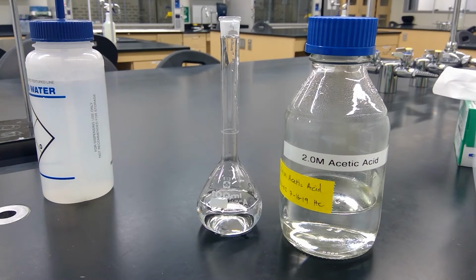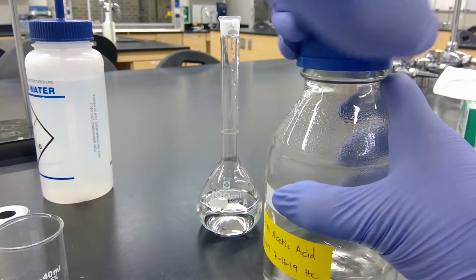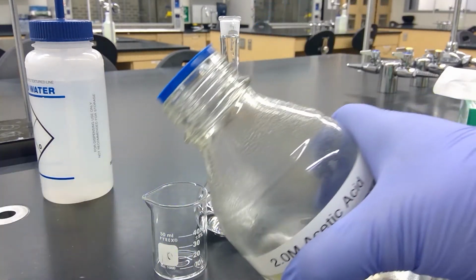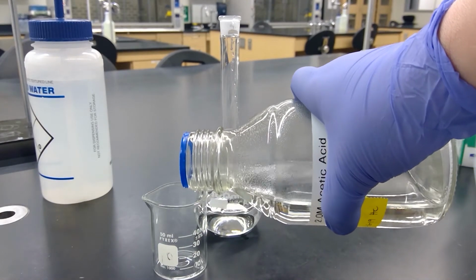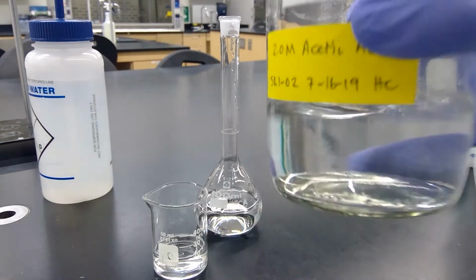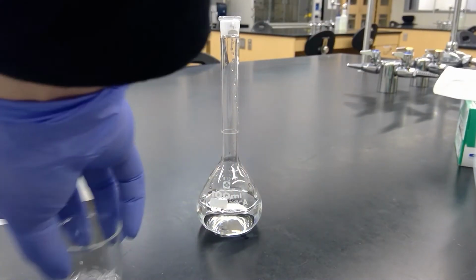And we don't need much, but I don't want to tell you the volumes because you're supposed to calculate that yourself. But I'm going to just pour out a little. So this is the stock acetic acid.